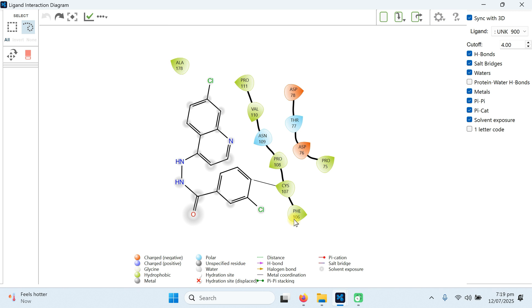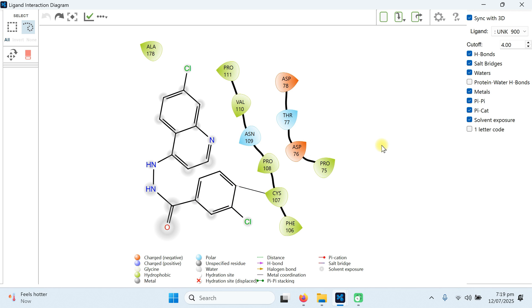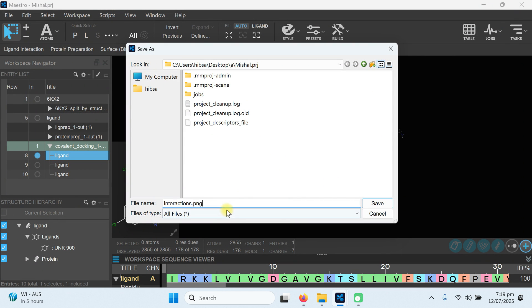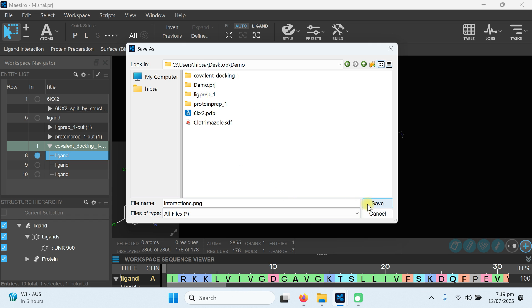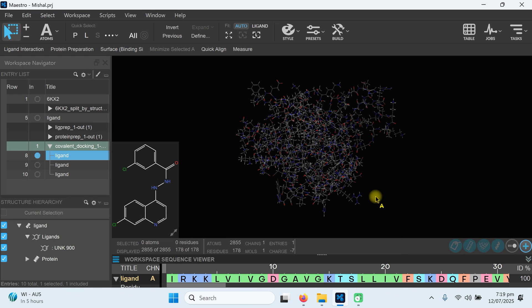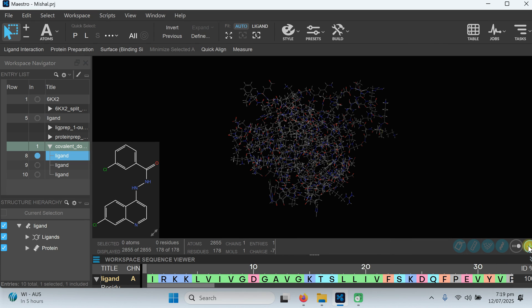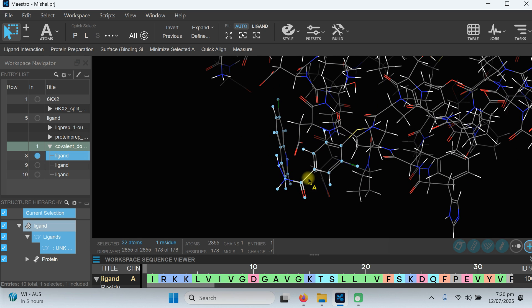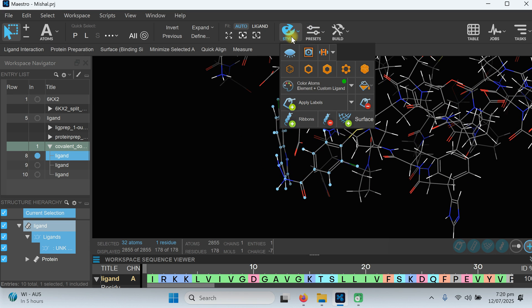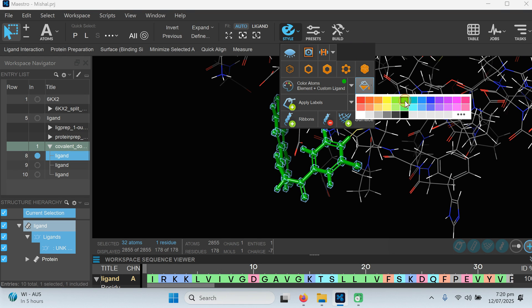You can see the ligand information showing the type of bonding. You can save it — the new ligand has been given the name UNK 900. When it asks for the save path, navigate to the desktop demo folder and save it. Our file has been saved. Now hide the 2D overlay to simplify the view.